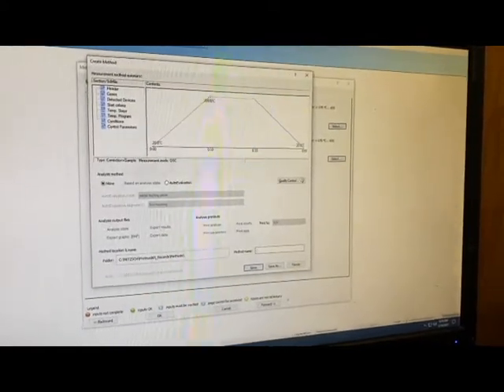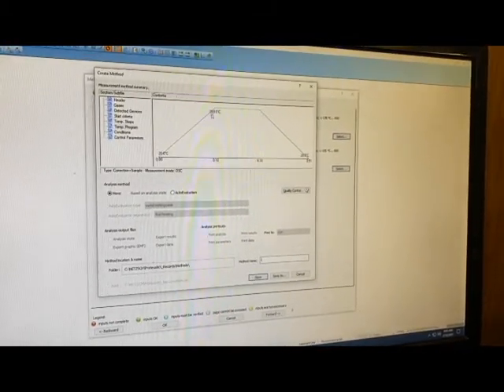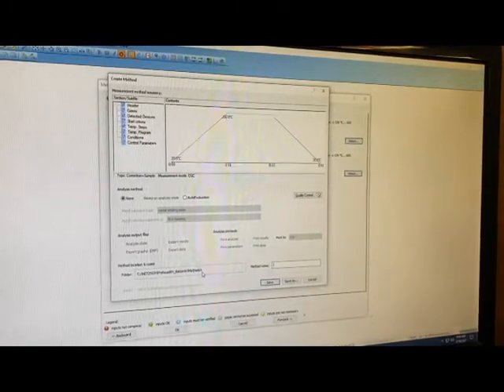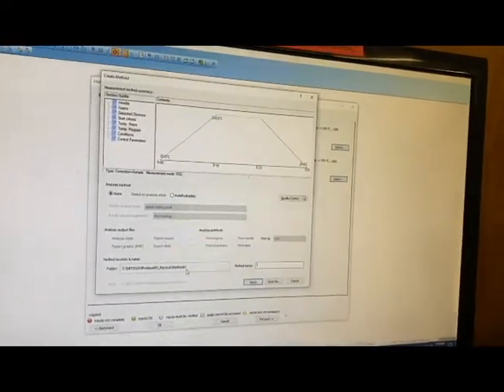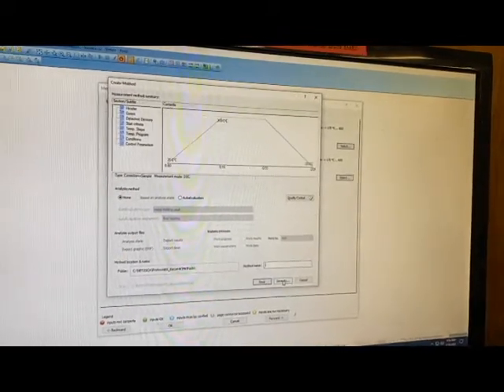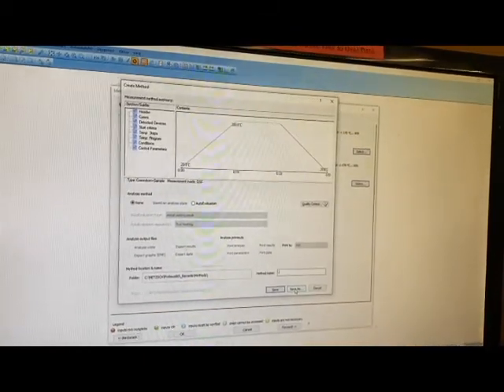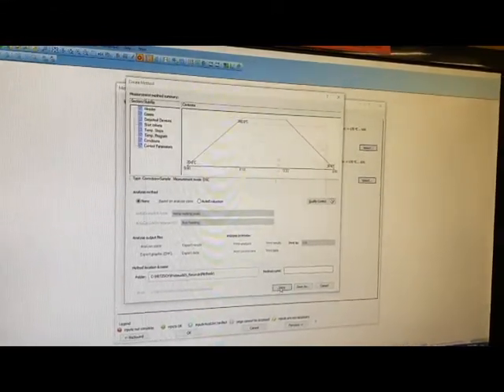It will give you a nice visual of what your temperature is going to do — heat up, hold, and then cool back down. It's going to save to the NETCH folder, which is a local folder on the computer, so that the software can keep track of whether you have an active calibration. Click Save, or Save As if you want to save a copy to your own folder — that can be helpful if you plan on modifying it later or want to export the parameters.